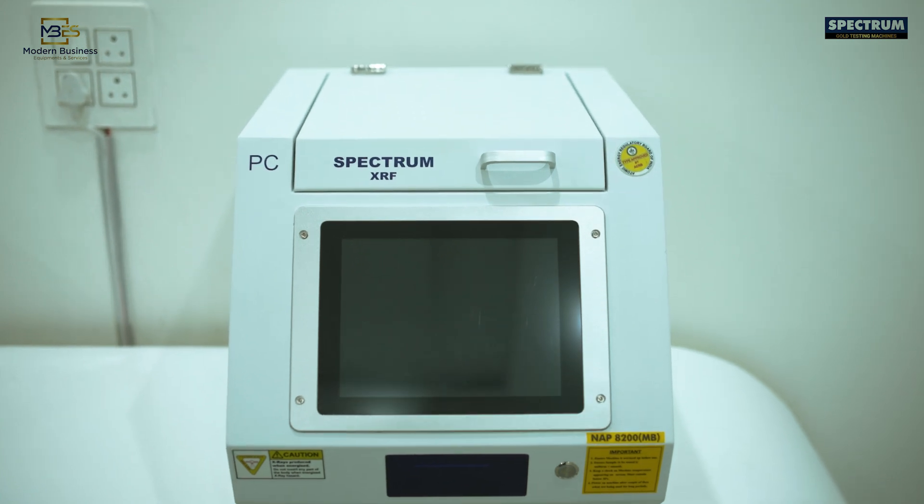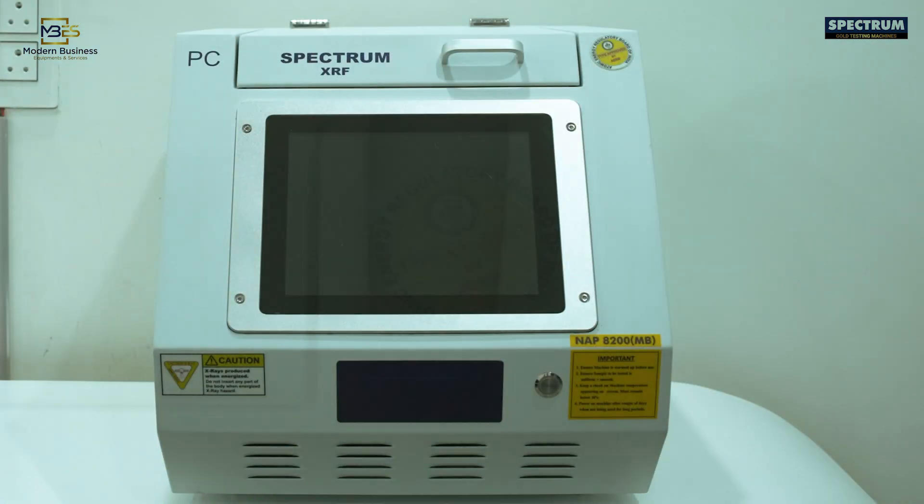It is approved by the Government of India, AERB department, for heavy-duty, accurate, and safe usage, and comes with this certification in your shop's name and logo on the machine.